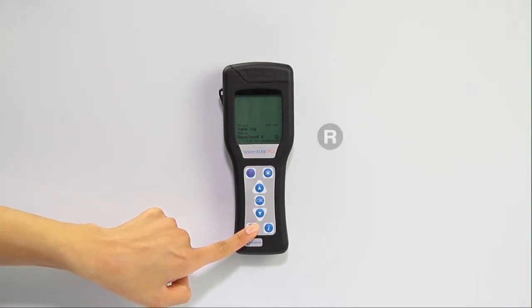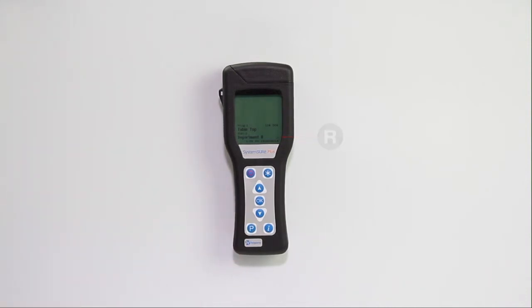Press the P button until you see an R flashing on the screen. Press OK to enter the Test Ready screen.